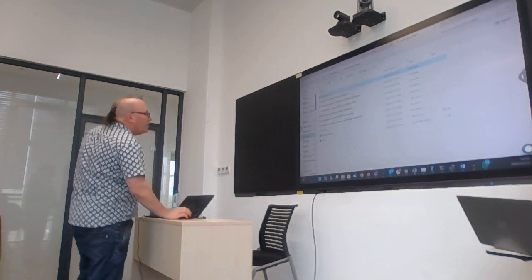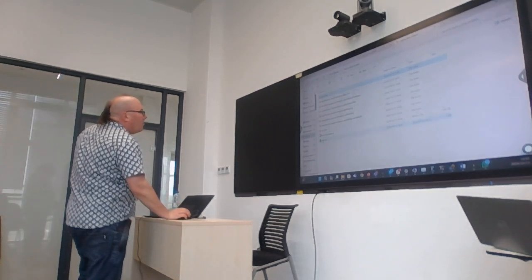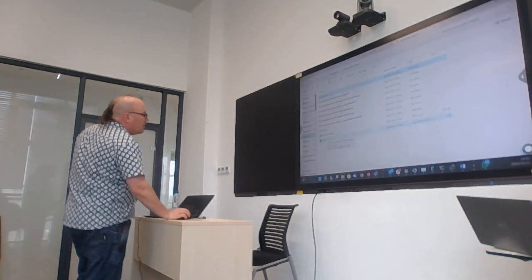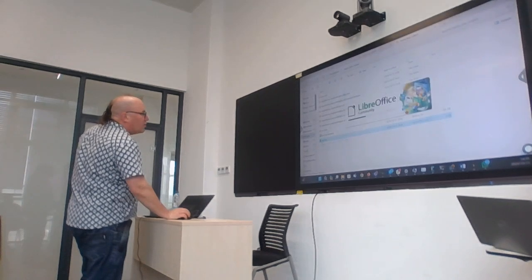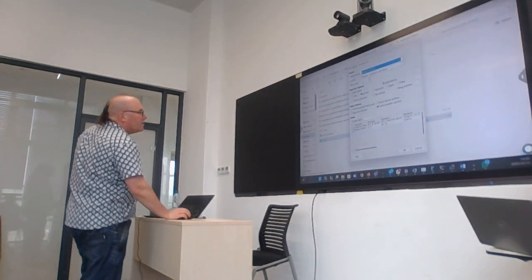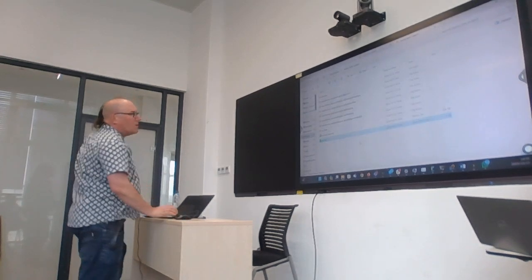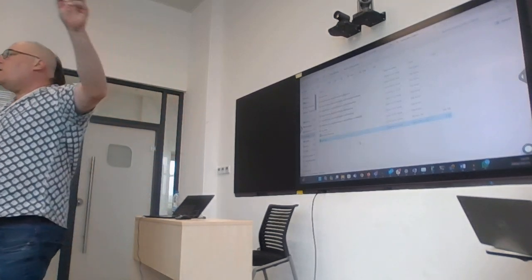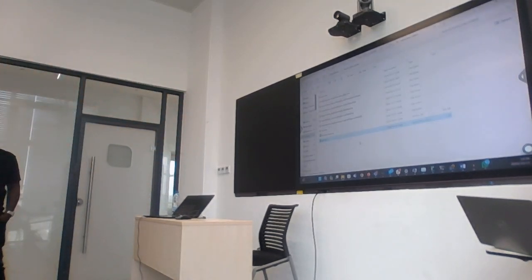But I just want to highlight two output files immediately. Okay? The first one is called run1.qc. Okay? run1.qc is a CSV, comma separated value file. Okay?